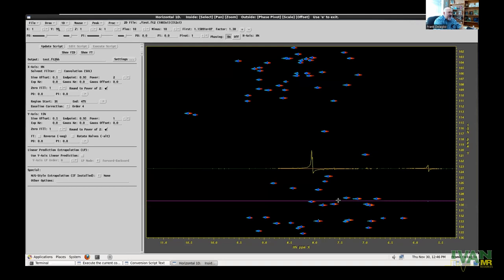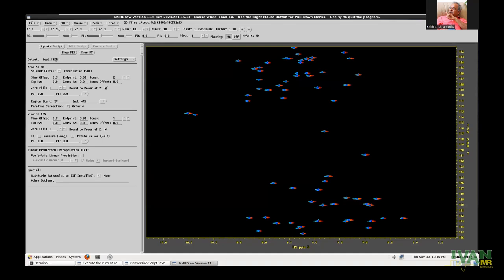And Frank, there is a question. There is a question by Ryan. Yeah, what's the question? Ryan, go ahead. Hey, Frank, how do you bring up that processing, that left processing section, if you start NMR Draw without using Varian or Bruker first? That's a great question.